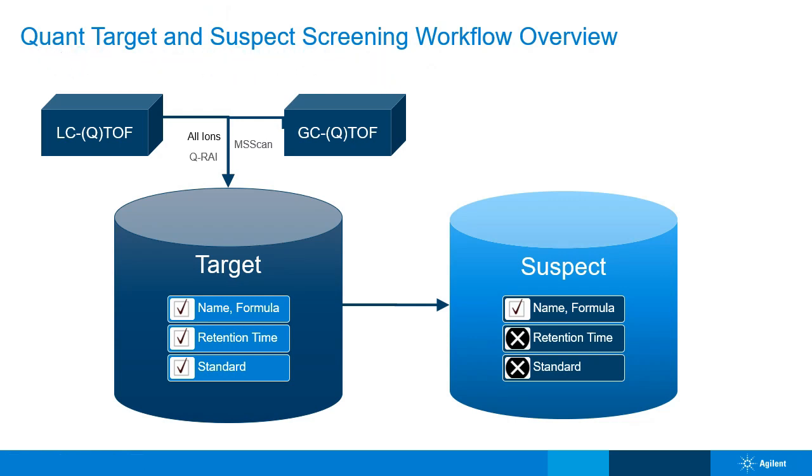There are a couple of different dimensions to look at here. One is the GC-QTOF workflow, which works in the expected way, deconvolution with SureMass and library searching. That's put into the screener so that we only see the hits, because when I go through such a long list of targets and suspects, I really want it trimmed down so I only see the hits or maybe the putative suspects to make a determination.